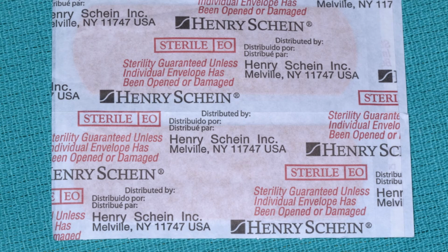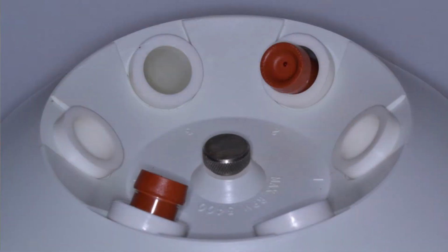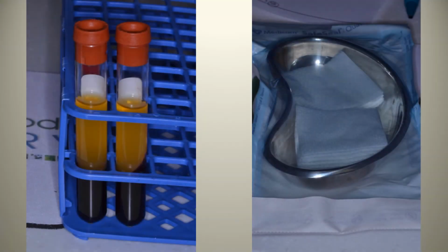When you put them in the centrifuge, remember that you want to put them apart from one another to weight balance the centrifuge. You usually spin this at around 3,000 RPM for 10 minutes. And after 10 minutes, this is what you have. You have your packed red cells at the bottom. You have your platelet-rich fibrin clot, and above that, you have your platelet-poor plasma on the top.